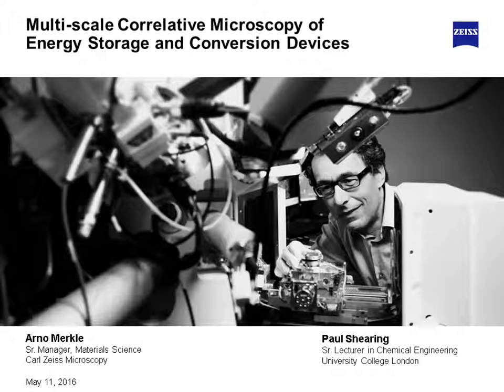One of the big challenges historically has been imaging batteries under any kind of operando or in-situ condition, because you're always depackaging a battery and having to expose it to air before you can transfer it into your vacuum chamber for whatever analysis technique you're going to use. With X-ray microscopy, because we can conduct this encapsulation under a protective environment, we can then very readily transfer from the glove box into the Versa or into the Ultra to look at these materials in their correct chemical state.